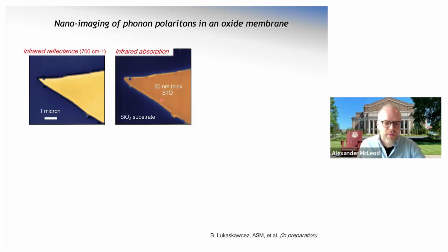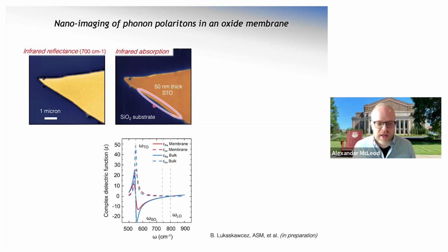because we noticed that if one peers really closely at these two-dimensional materials, okay, these two-dimensional membranes, particularly right close to the edge, you can see something really funny. It looks like those fringes that we saw in the graphene plasmons. And we have to zoom in very closely in order to see. So what might be going on here?